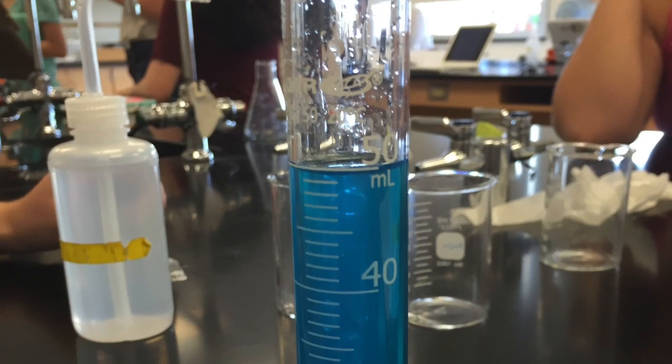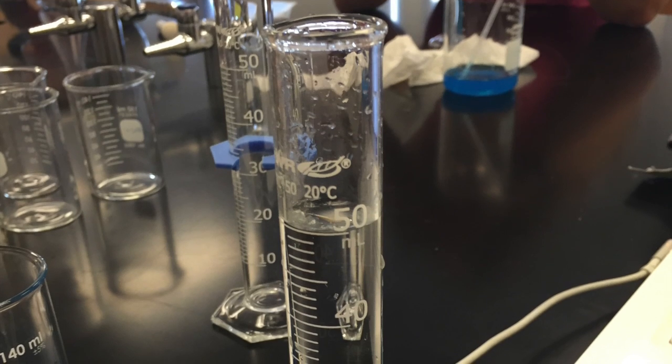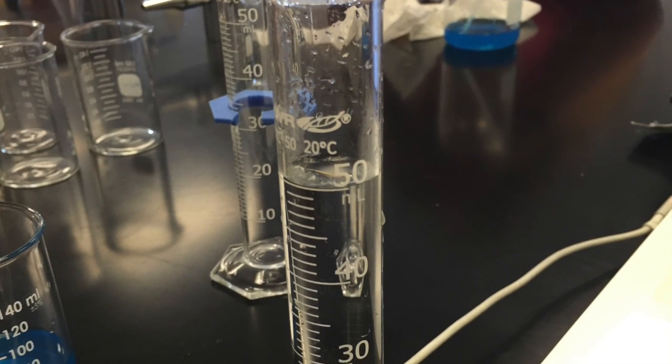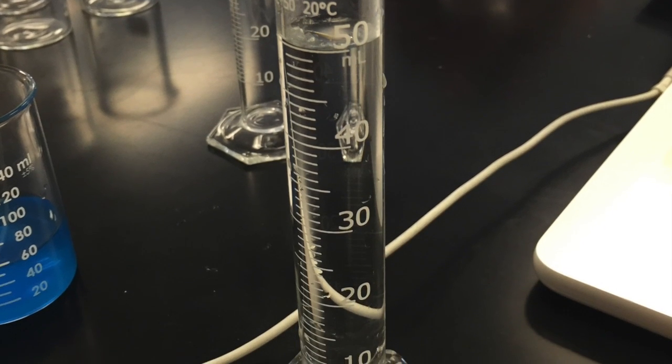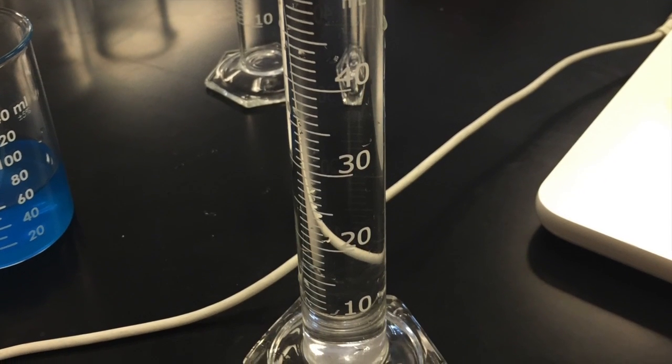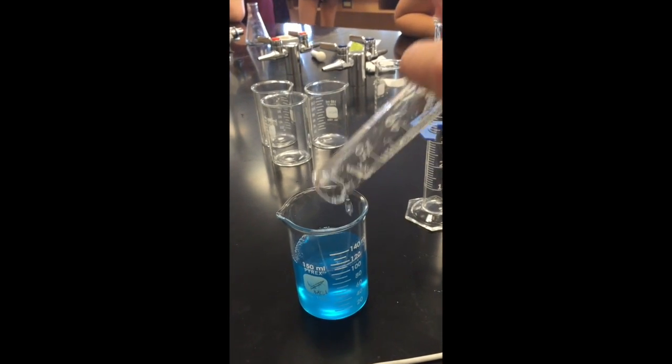This is then repeated for any other dilutions that need to be performed. And then, as you can see with our final dilutions, the various shades of liquid created. This is because we used a colored solute, which allows us to see the actual dilution.